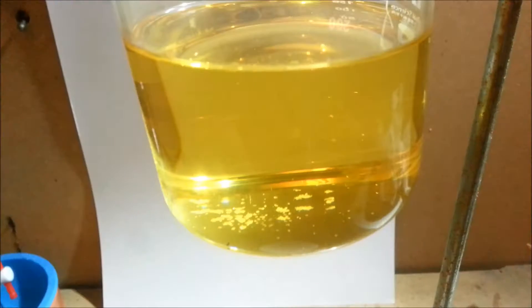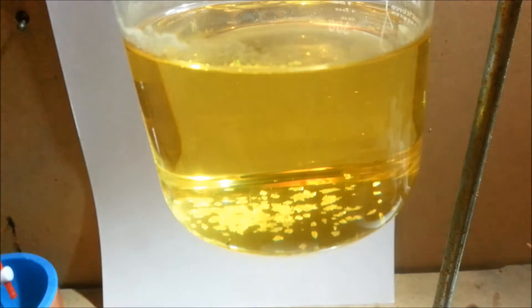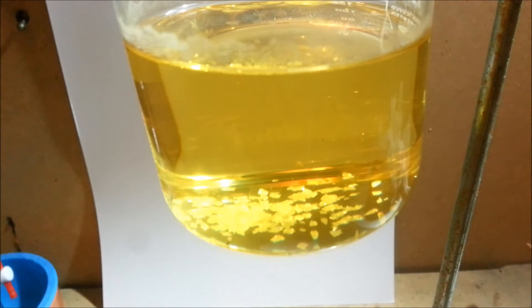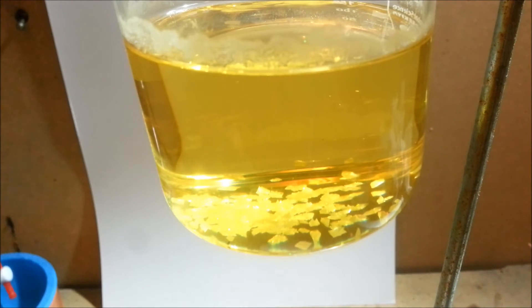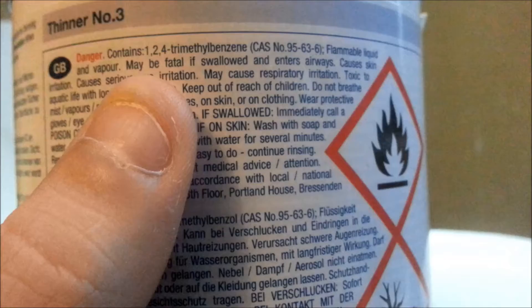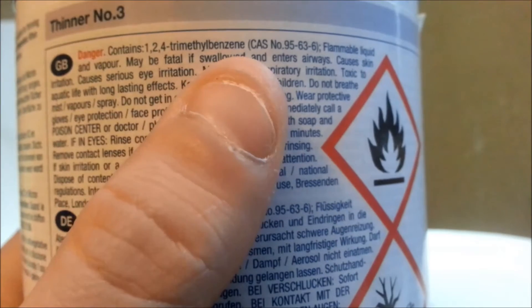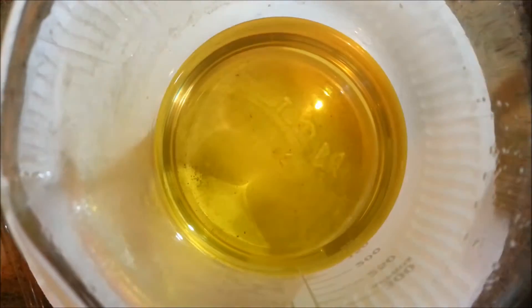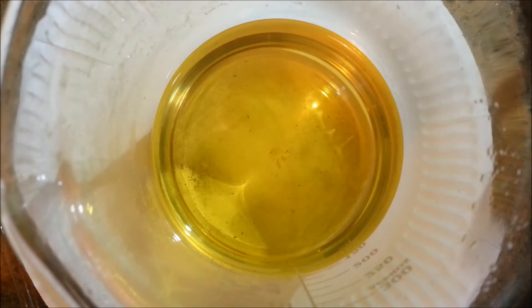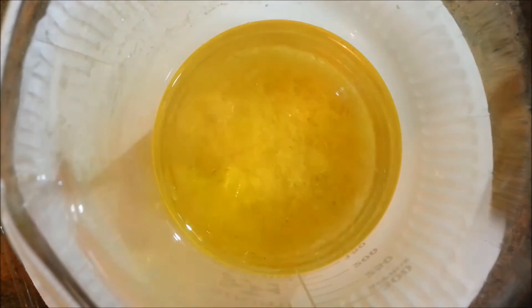Sulfur is insoluble in polar solvents like water, but is to some extent soluble in non-polar organic solvents like aromatics or cycloalkanes. It dissolves really well in carbon disulfide, but this is not easily obtainable for the home chemist. Many paint thinners contain aromatics and can be purchased at your local hardware store. Just look at the back and see that it contains either xylene or trimethylbenzene. Benzene and toluene can also be used but have lower boiling points, which is a slight disadvantage for this method.